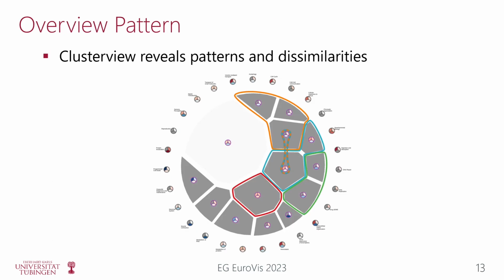The overview can be used to reveal general patterns across the clusters. For example, the cluster outlined in red is the only cluster having an average upregulation across all omics. Orange and teal show upregulation in transcriptomics and downregulation in proteomics. They differ, however, in that orange does not have any metabolic measurements mapped to the contained pathway, which is highlighted in the orange-teal dashed line.